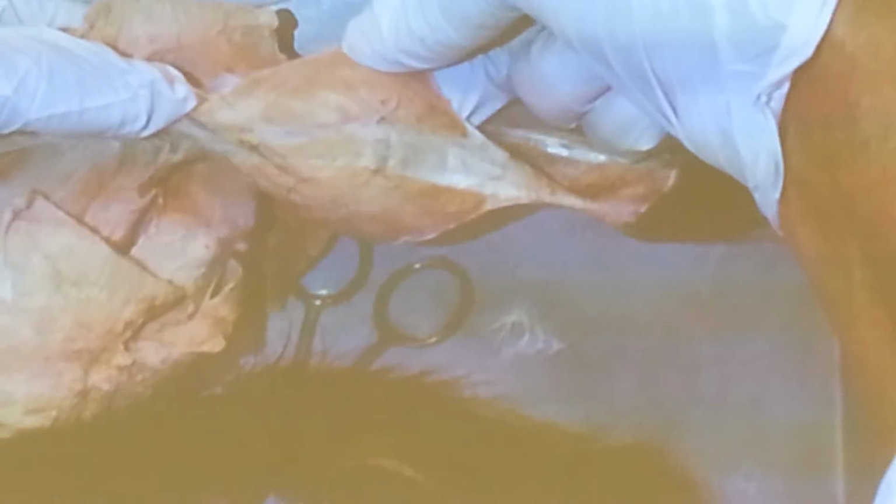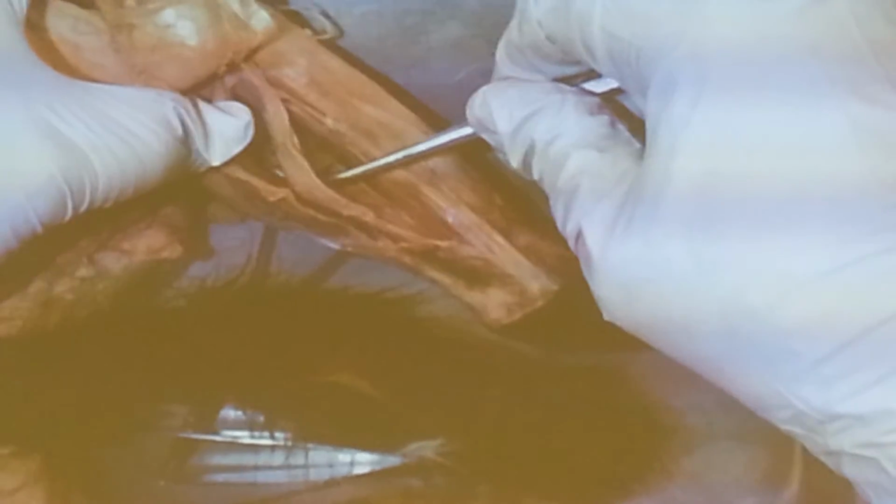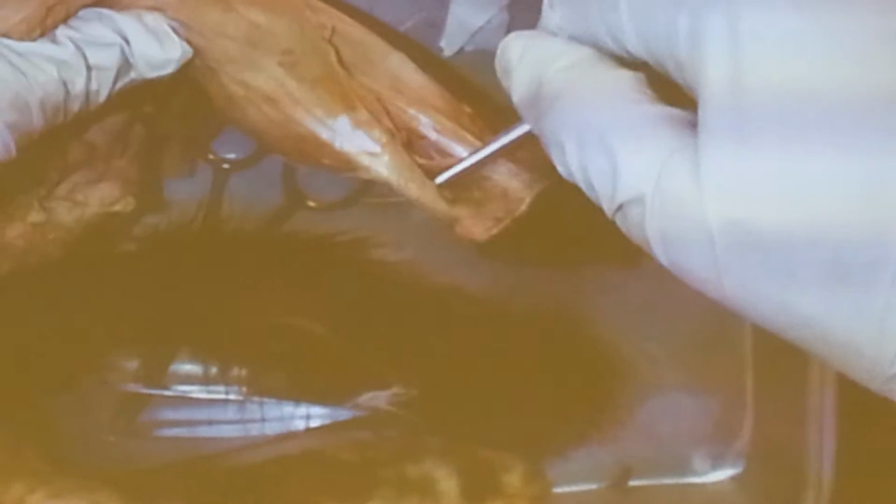Any question here? No? Then let's go over the leg. On the leg area, this is the continuation of the biceps. If you put it away, you will see the calf muscle, called gastrocnemius. If you open it completely, you will see that it has two heads, and you see the space between them. When you put it away, you see another muscle, called soleus, just beneath the gastrocnemius. Together these make the Achilles tendon, or calcaneal tendon, that attaches to the calcaneus.